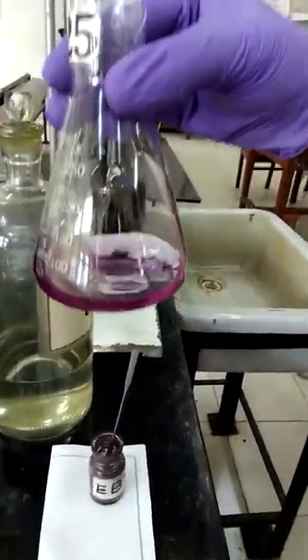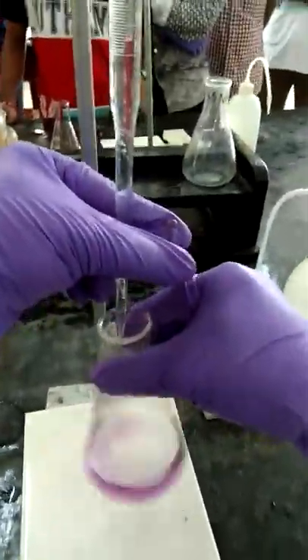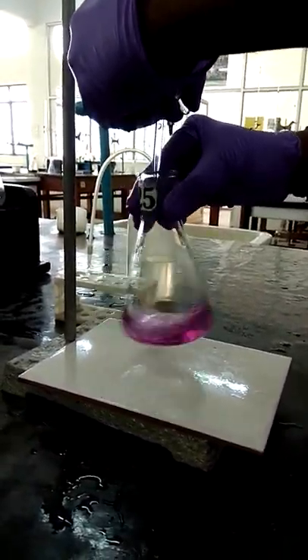I will titrate the solution against standard EDTA. Hold the conical flask in the right hand with three fingers, then titrate against standard EDTA. Hold the tap of the burette in your left hand like this. This is how you should do the titration. Keep adding and keep shaking. You have to add drop by drop and keep shaking.